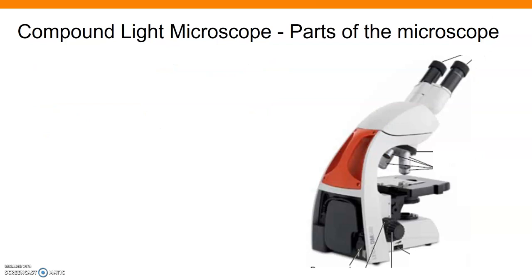Let's start by looking at the parts of the microscope. From this view, we can see a few things and then we'll turn it to look at the other side so we can talk about other components.